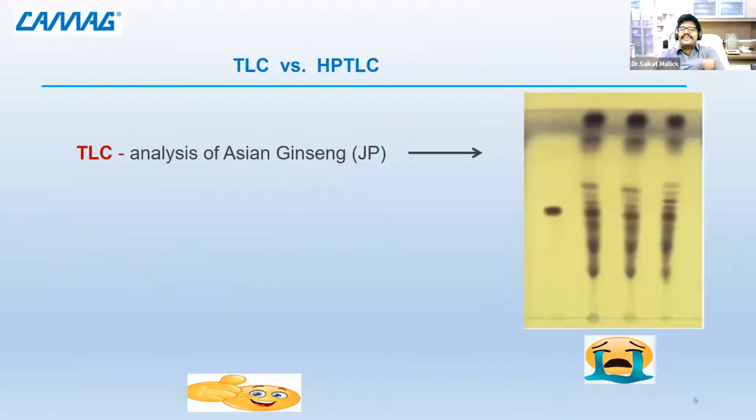So now let us see what is the basic difference between TLC and HPTLC. As I told you, in TLC, what people used to do is take some capillaries and abruptly load some volume. No standardization was there, and we used to see the spots, mark the plate with pencil and the developing front. Even an image taking system is not there in TLC. You just have to observe and write your results. So many people used to make journals, and in them draw the plate and mark where the spots are.